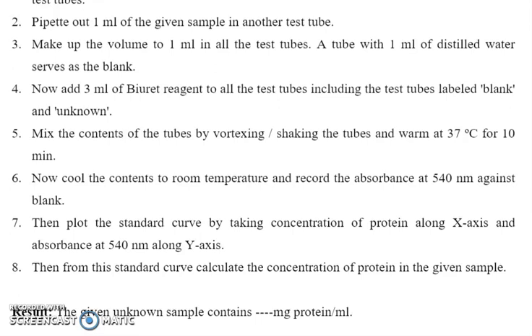So these are the 8 steps. You can follow all these steps carefully and do your experiment step by step. Don't miss or forget any steps, because each step has its own importance. Before performing this experiment, you should wash your glassware very clean. If it is not clean, then you will get ambiguous results. So all your glassware should be clean.